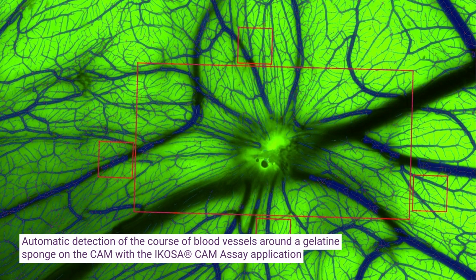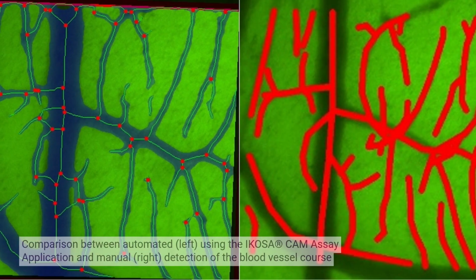Yeah, well, yes, definitely. The AI tools have been a big help to us. Microvascular analysis done by hand is a really time-consuming process, and it also bears a high risk of inter-rater bias, since you have to identify the vessels and detect them all on your own, which takes hours. Especially if you have large images, you can somehow circumvent that problem by using regions of interest instead of the whole image. But obviously, that makes the sample size a lot smaller than using big images with lots of vessels. On the other hand, it's still a very time-consuming process.